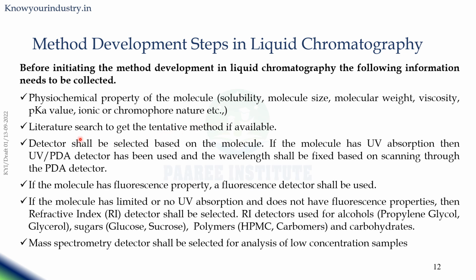Then a literature search needs to be conducted to see if any method is already reported in prior art. If a method is reported, that method can be taken as a tentative method and further developed.